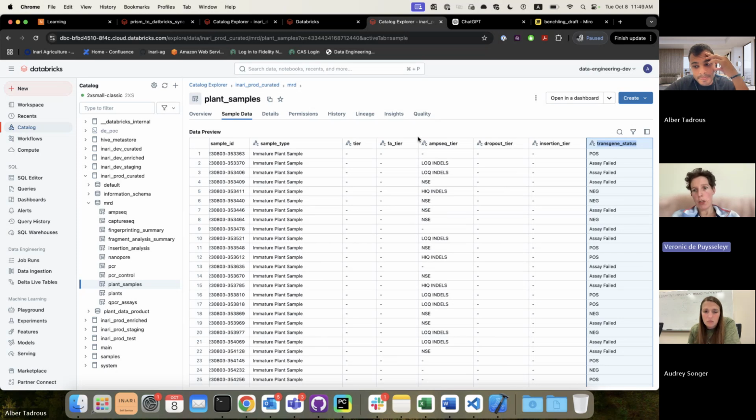Or you make it biological sample, then you have your sample identifier, that's the sample ID. Then you have columns for the origin. It can be a plant, it can be a protoplast experimental condition, it can be empty in case it's a generic one. And then product just fills out the plant and the sample ID.